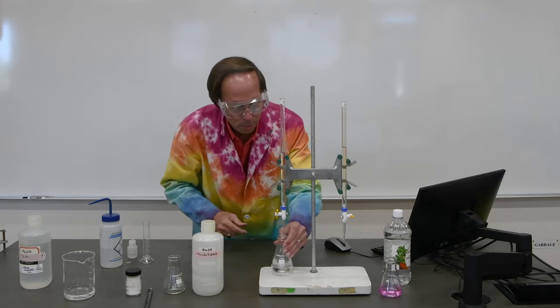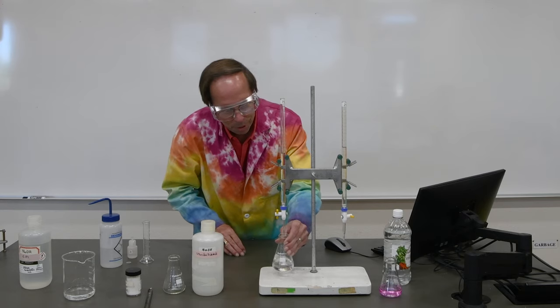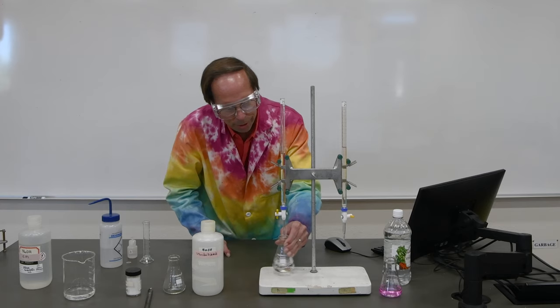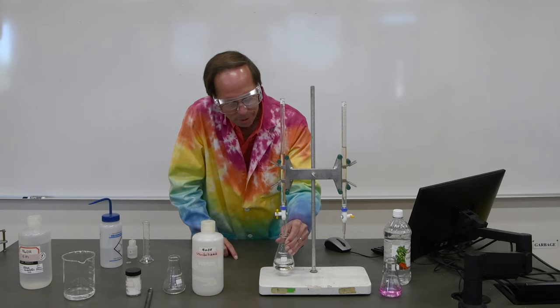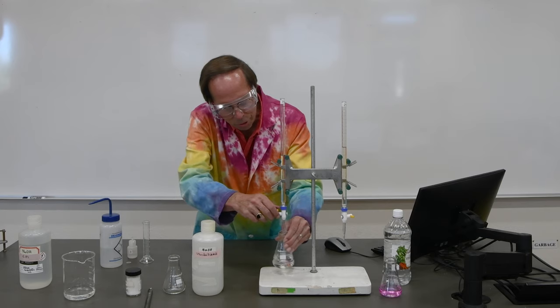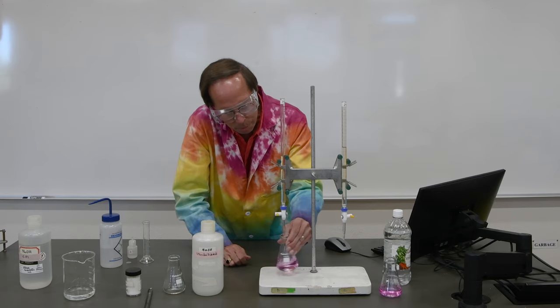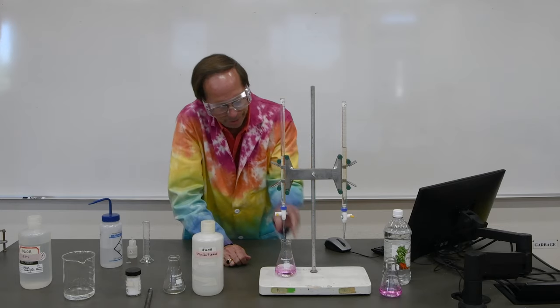There we go. Drop and swirl. We can see the pink appearing momentarily, but it's still being consumed, which means there's still acid present. Notice how I never look at the burette when I'm finishing this up, because it tends to bias you. You might want it to stop at a certain point. That looks like we might have it there. I think that did it.